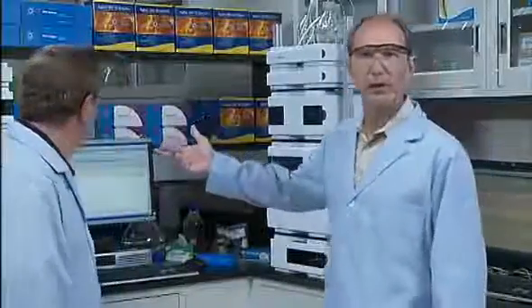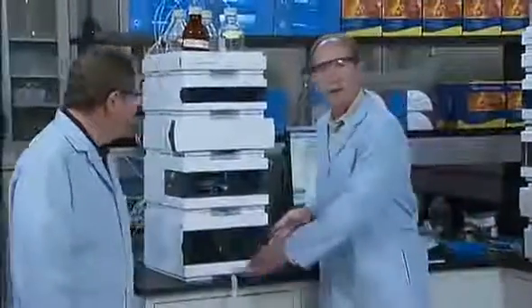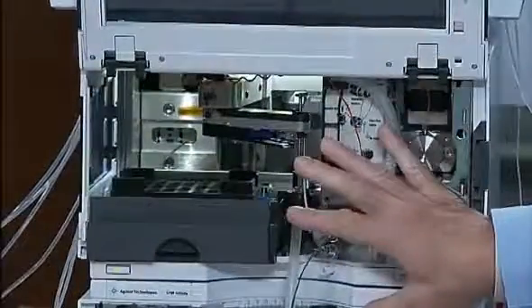Well, one principle to remember is that we can only know if something is wrong if we know what it looks like when it's right. So here's one tip I'd like to point out from an instrumentation point of view. Let's take a look at the system here, an Agilent 1290 Infinity LC. The system consists of a pump, an autosampler or injector, the column, the detector, and the data system or integrator.